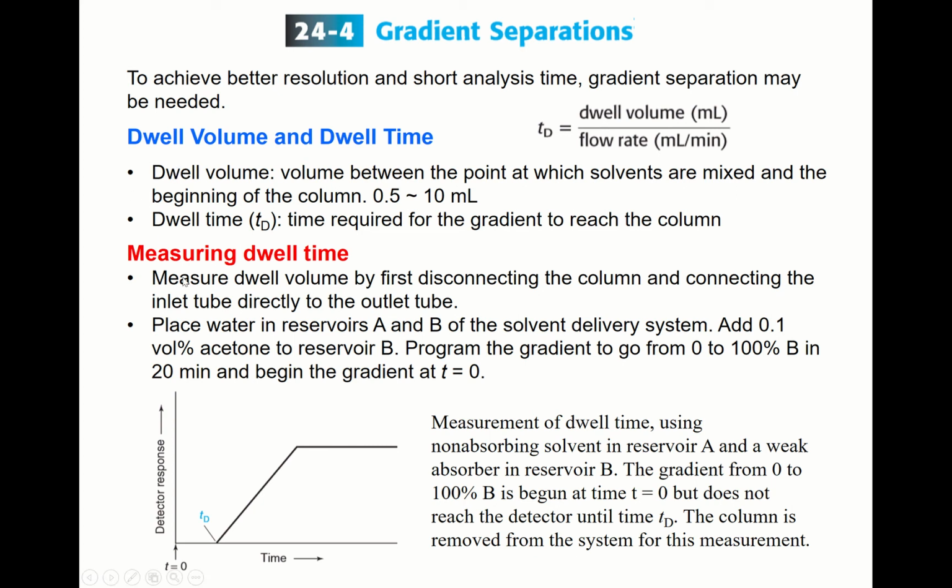First the solvent and your sample should pass through this dwell volume. So it's important to measure the dwell time.